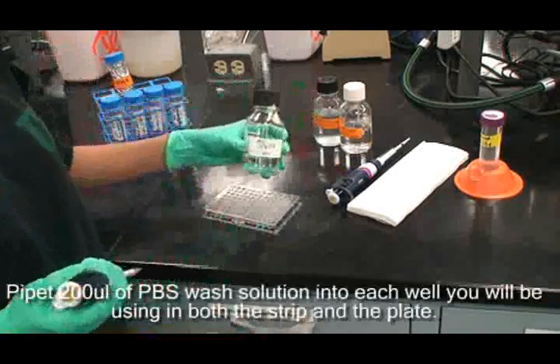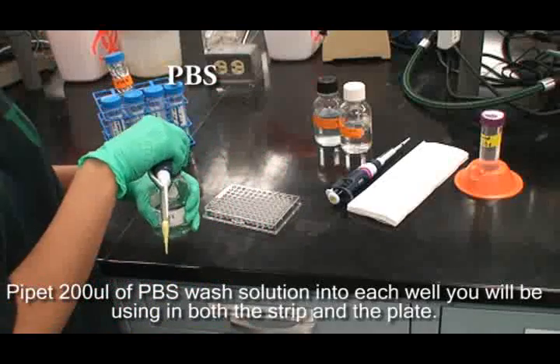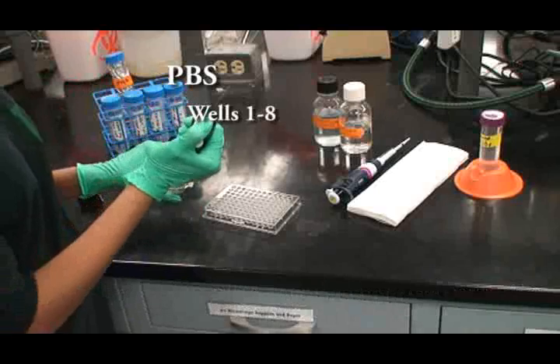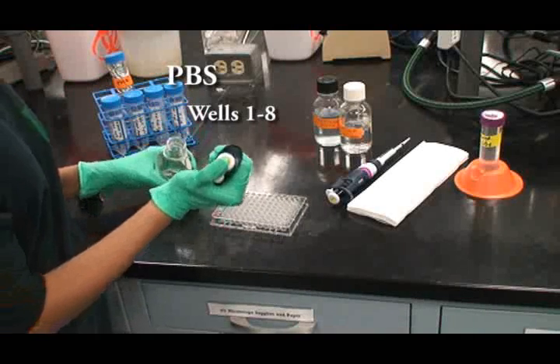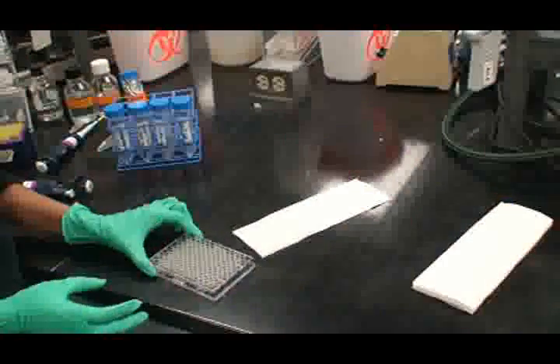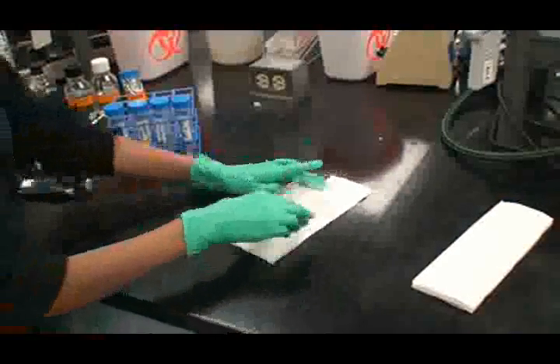Pipette 200 microliters of PBS wash solution into each well you will be using in both the strip and the full plate. Empty by tapping on a paper towel. Repeat two more times.